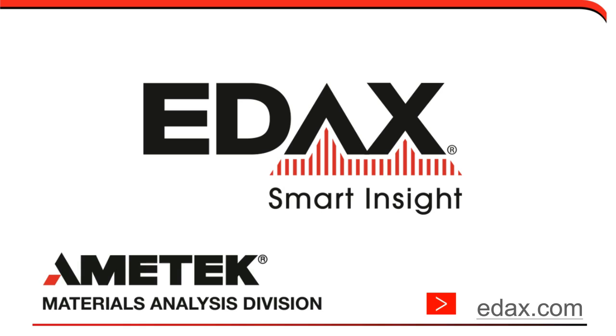So the first question that I'll answer says, when will this be available? That's, of course, a key question for us. We will be announcing and launching this product within the next couple of weeks, where there'll be commercial information available. At that point, it would be good to talk to your local sales representative. He can get you some more information, and there'll be full product information at that time.